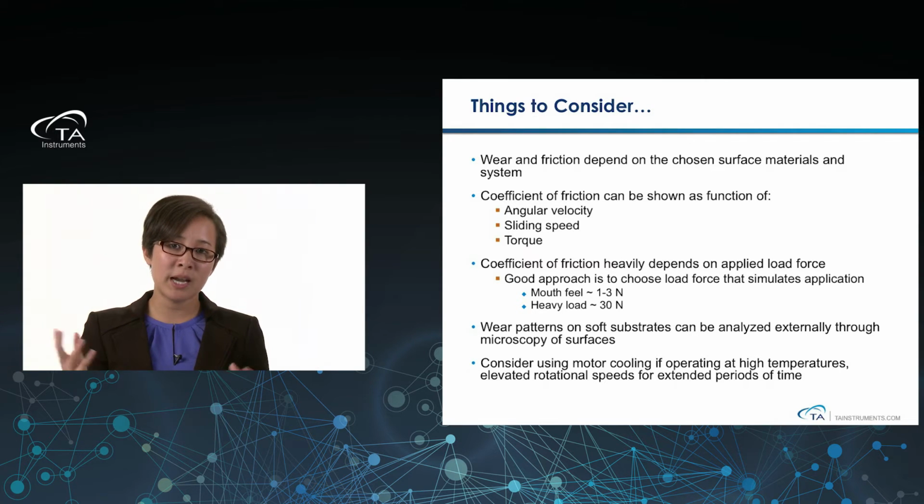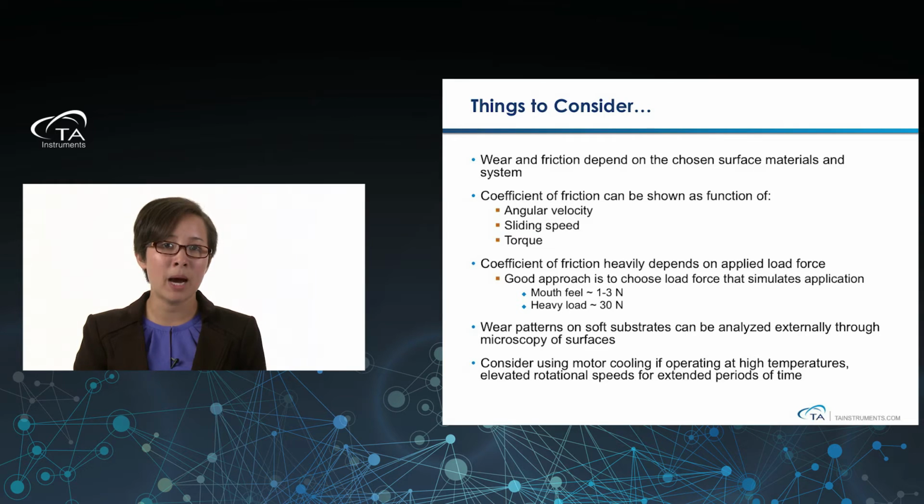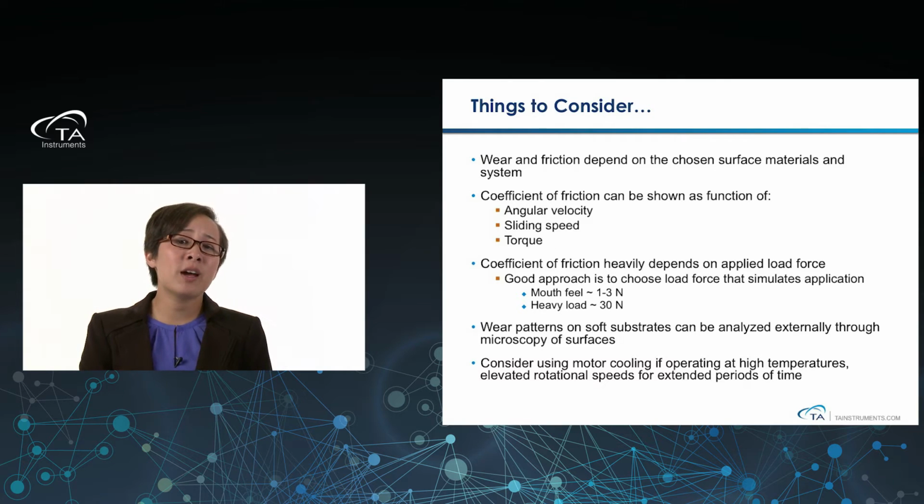And so when we're designing a test and trying to figure out what to do, these are all the things that we need to keep in mind and decide ahead of time while we're doing these tests. The coefficient of friction will also heavily depend on the load force. So sometimes you think, well, what load force do I use? I'm not really sure what I'm doing.